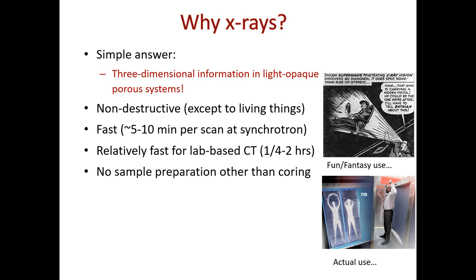If I were to image this sample, I should basically cut it to the size or volume that I want to image. That way, I'm avoiding wasting some of the energy on imaging stuff that I don't want. Now, this is also part of the limitation. We could technically get very good resolution, even better than 1 micron. But if I need a core, I'm cutting it down to 1,000 pixels times that 1 micron.